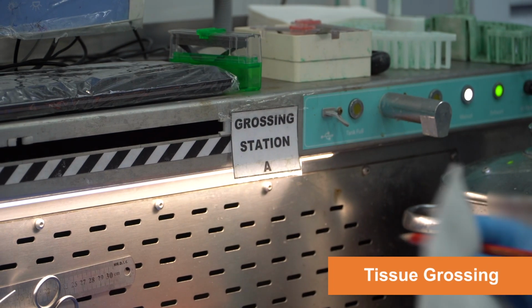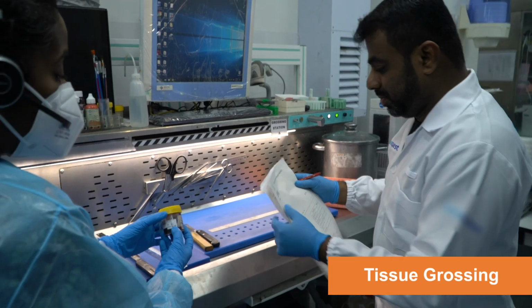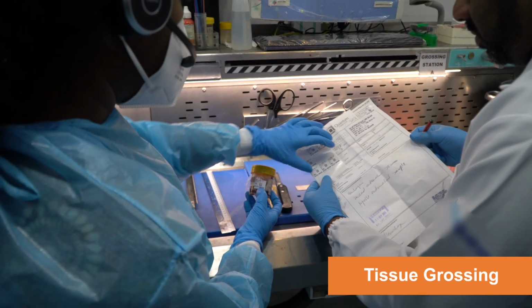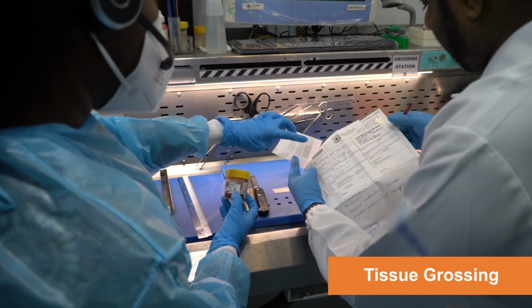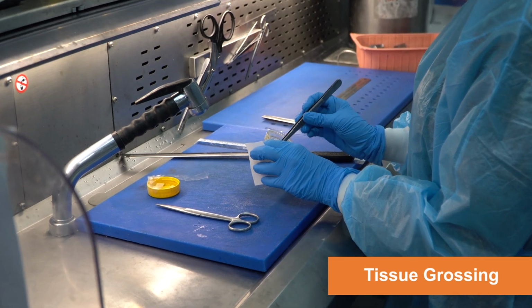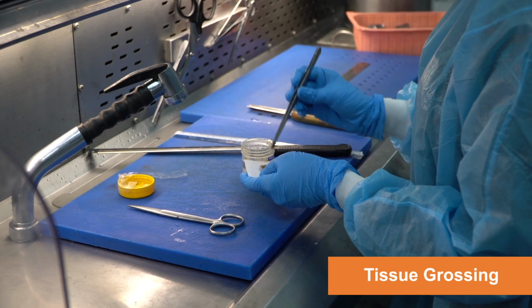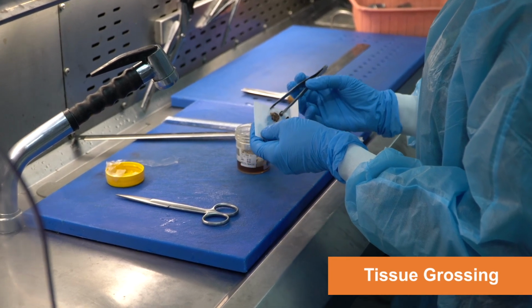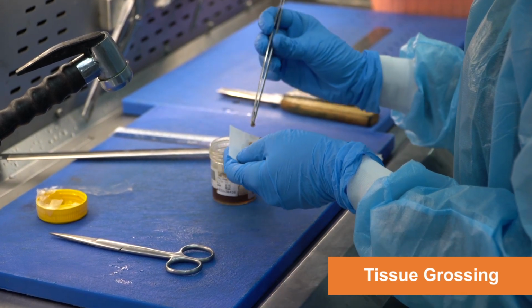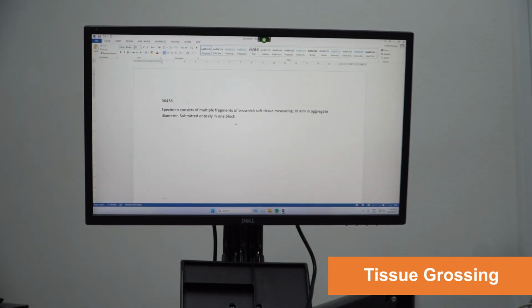In the grossing step, specimens are meticulously inspected, described, and sectioned to extract the most diagnostically valuable tissue. Pathologists rely on this detailed gross examination to provide crucial insights during microscopic evaluation. Using sharp knives or saws for soft or hard tissues, respectively, the tissue is carefully cut and placed in plastic cassettes for fixation. Fixatives play a vital role, preserving tissue architecture and thwarting enzymatic degradation, ensuring optimal conditions for accurate diagnosis.